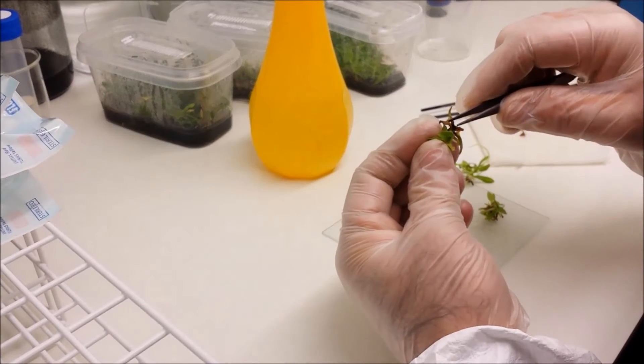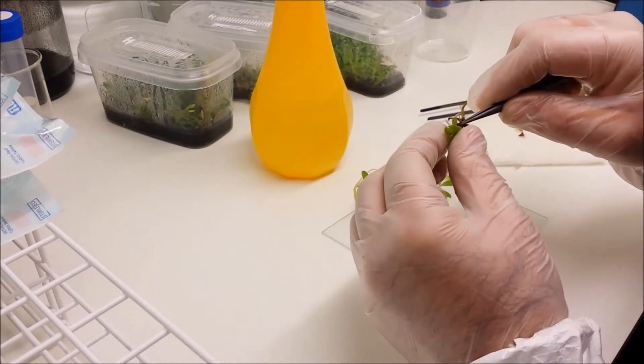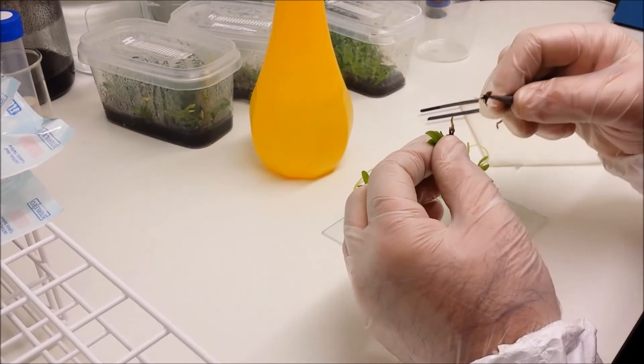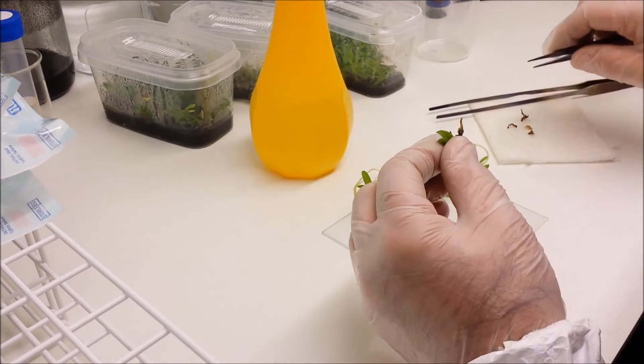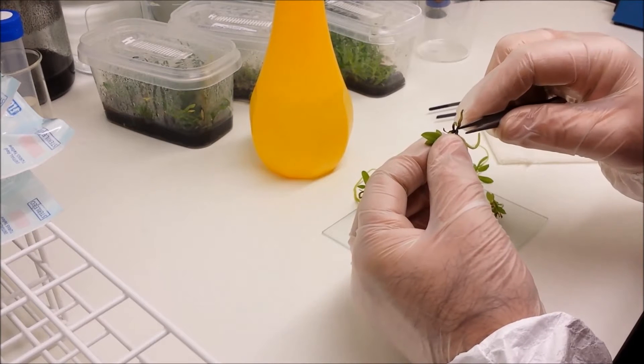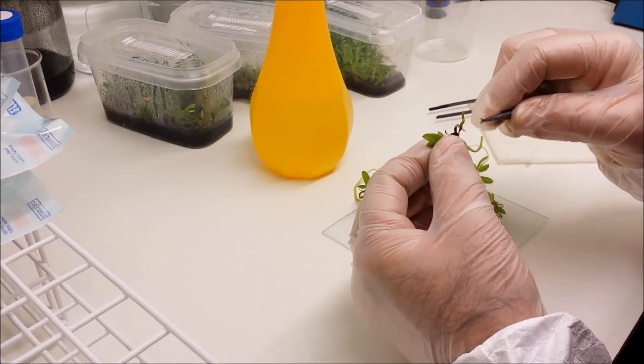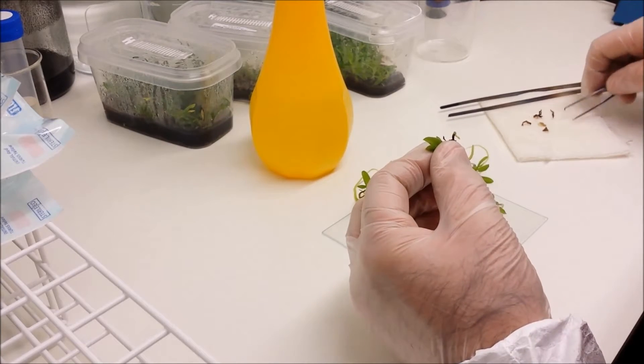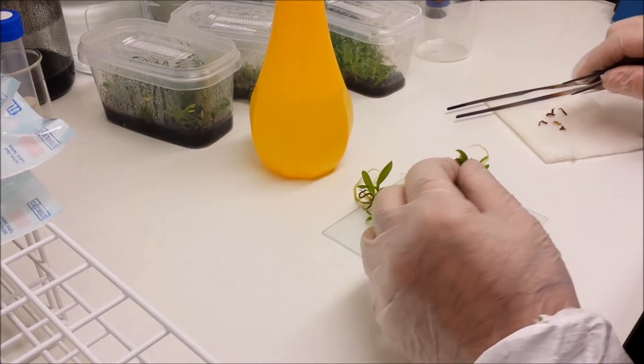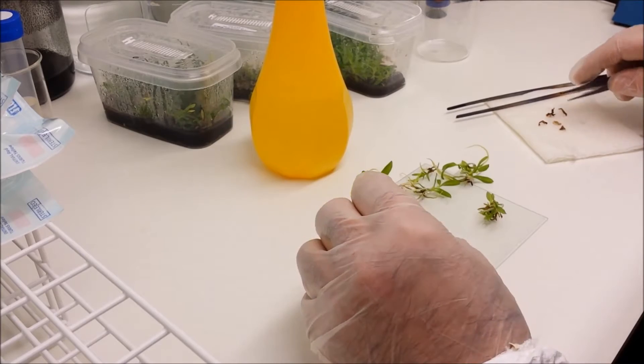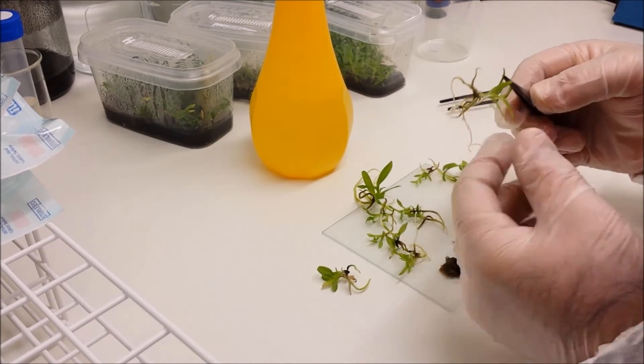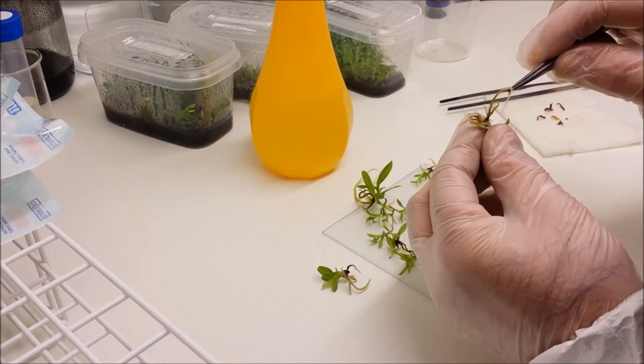Now what I'm going to be doing now is I'm using the fine tweezers to remove any dead bits. So you'll occasionally get little dead roots, dead bits of leaves. Really what I'm doing is I'm trying to remove anything that may become contaminated or cause a problem when we re flask it. There's no point starting off from a bad point. So the more you can tidy these little plants up the better.